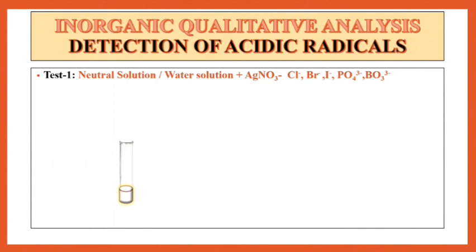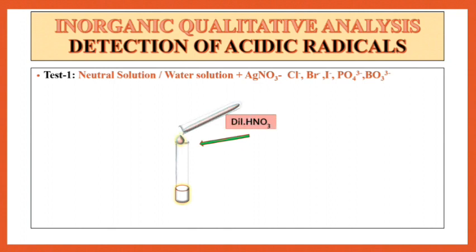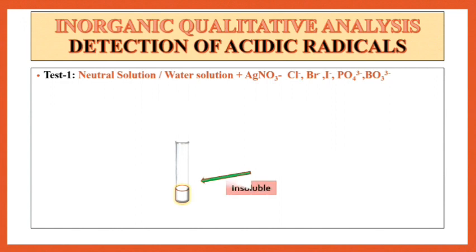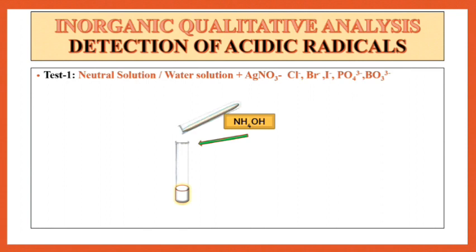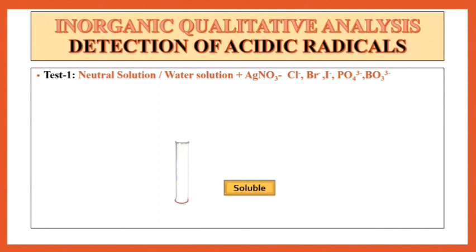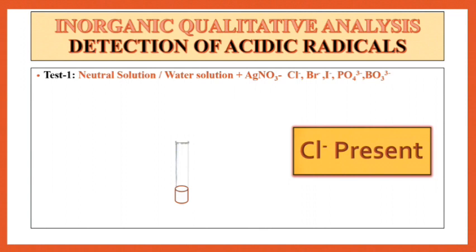If a curdy white precipitate is obtained, then to this curdy PPT add dilute HNO3 drop wise. It is insoluble. Now to the same solution, add NH4OH drop wise. It is soluble — it means that Cl⁻ is present in the mixture.